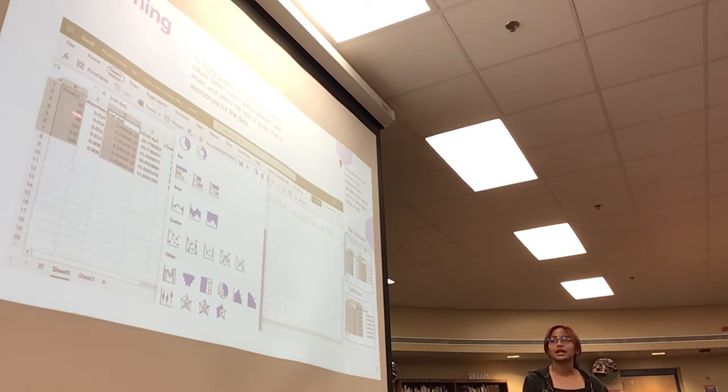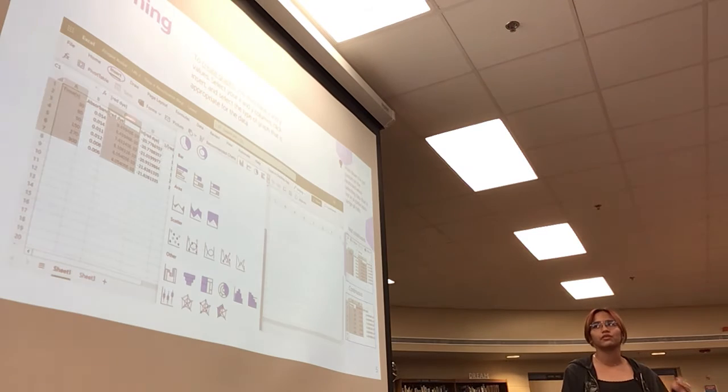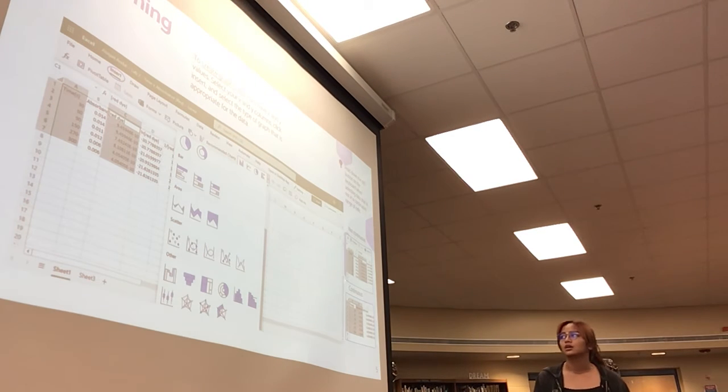And if your data is like this one and you're trying to compare the X with different Y values, then you're going to create a non-continuous range. And this is basically when you have to select one row before and then hold down Control and then select your other column. So that's basically how you select non-continuous data. Any questions about that? Okay.